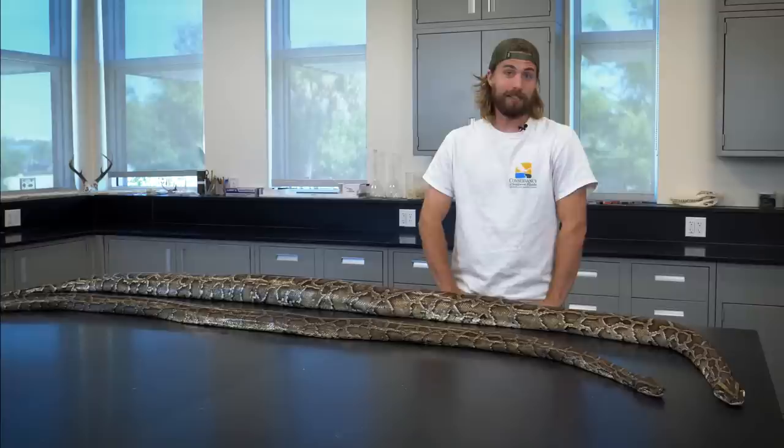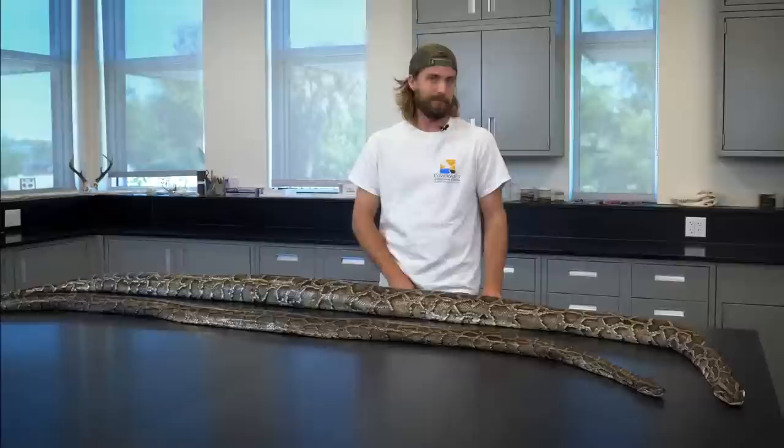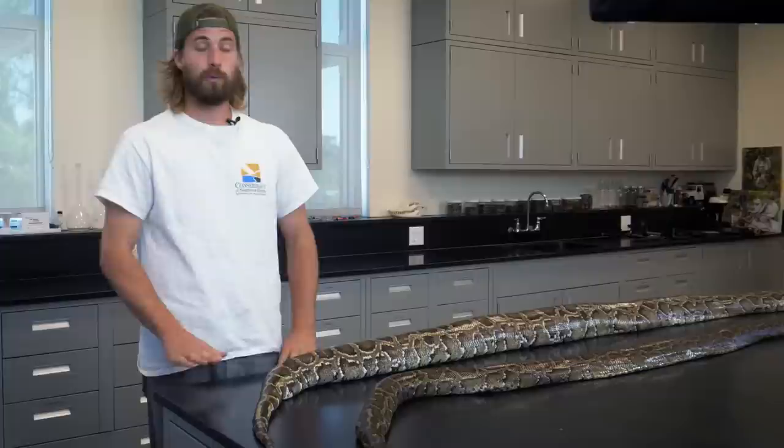I'm Ian with the Conservancy of Southwest Florida. I'm a field technician on our Burmese Python research project, and I'm here to show you that they're as cool on the inside as they are on the outside. When we're in the field and we're capturing pythons, one of the first things that we need to know is whether or not that python is a male or a female, and there's one quick and easy way that you can tell.